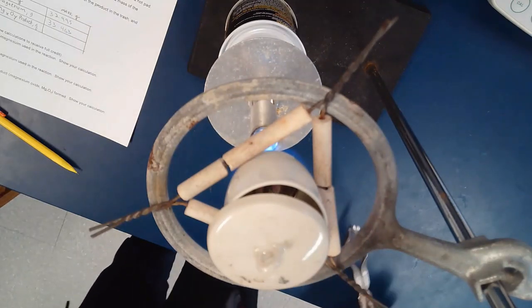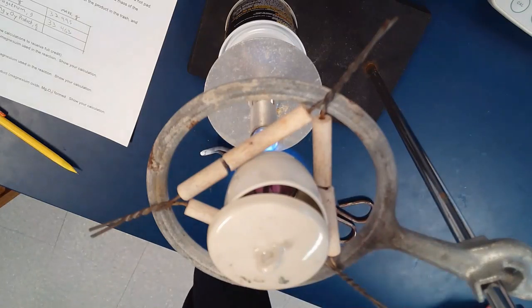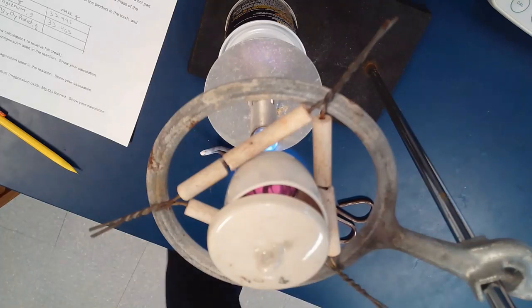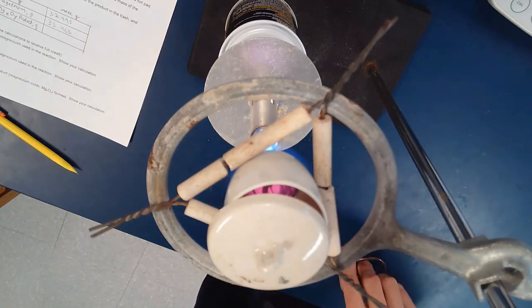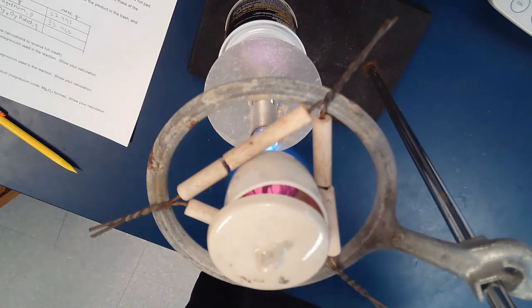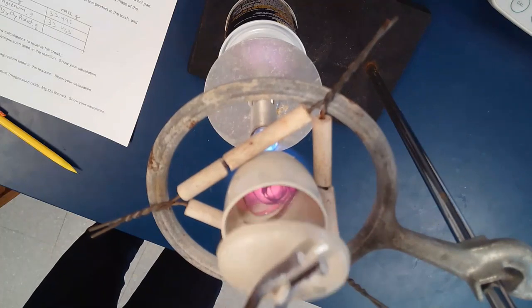Once the crucible gets red hot, Mr. S is jumping in here. Once the crucible gets red hot, the magnesium will then be able to spontaneously, you can see it kind of glowing inside, right? We'll be able to spontaneously react with the oxygen that's in the air around it and create that MgO product, the MgxOy product. Mr. McGinnis will take the lid off so you can see what's going on inside, and then we'll put it back on.